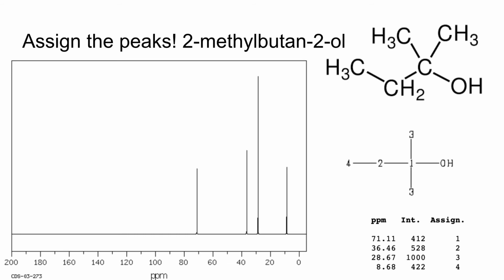You'll be given a spectrum like this, and there'll be a discernible difference in peak height if there are multiple carbons in the same environment. Like that's a huge difference. You don't need to know the intensities; they're not really useful. Just by looking at it, you can tell.